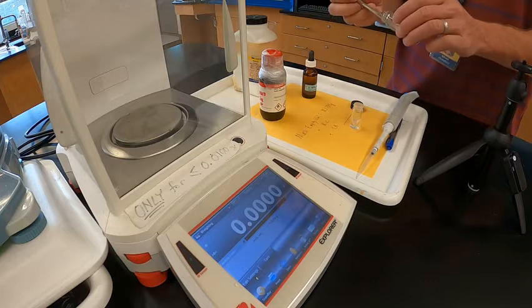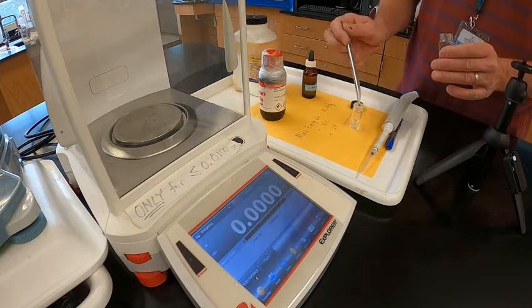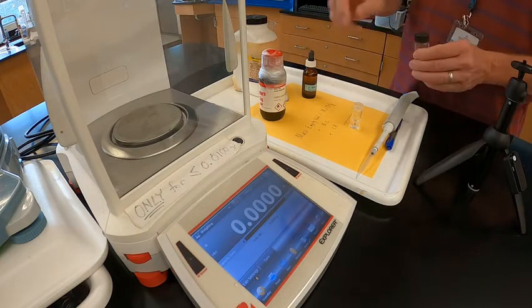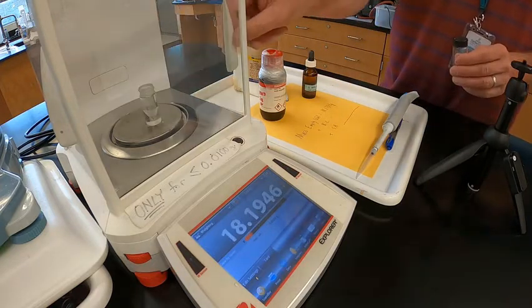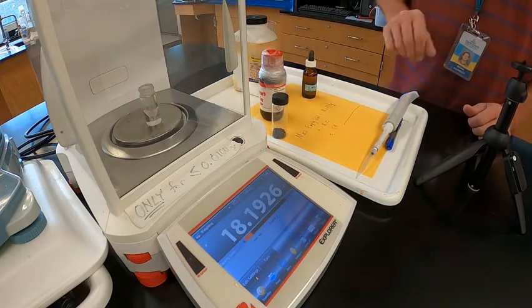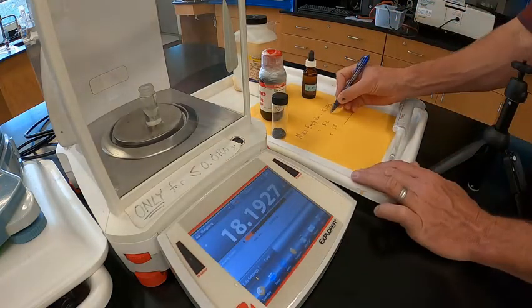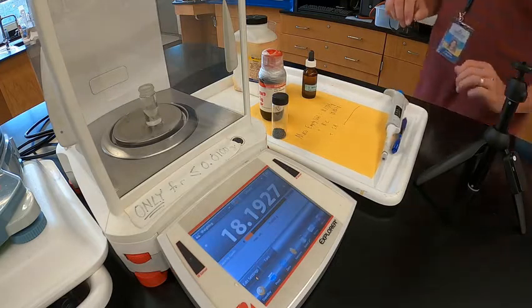Never in the balance, because if you do it in the balance, it's much more likely that you could spill things and make a big mess. I've added the boiling chip. Now I'll take a new mass and record that. I'll show those numbers in a minute.